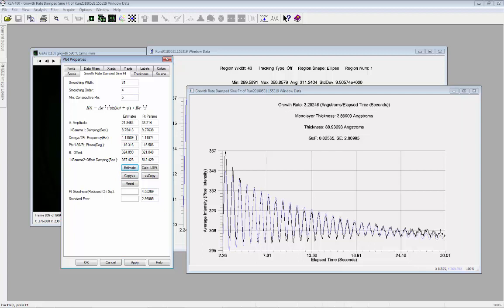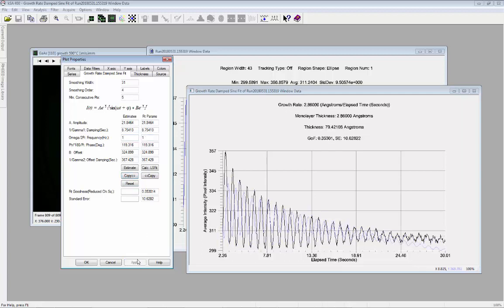Note that the estimates of the parameters can be edited directly in the dialog boxes. The resulting fit can be recalculated and applied to see the new fitted curve. One can also directly copy the estimates to the fit params dialog boxes to see the resulting curve. This allows the user to directly see the effect of changing the fit parameters. The reset button can be used to reset the parameter estimates as well as the smoothing parameters.